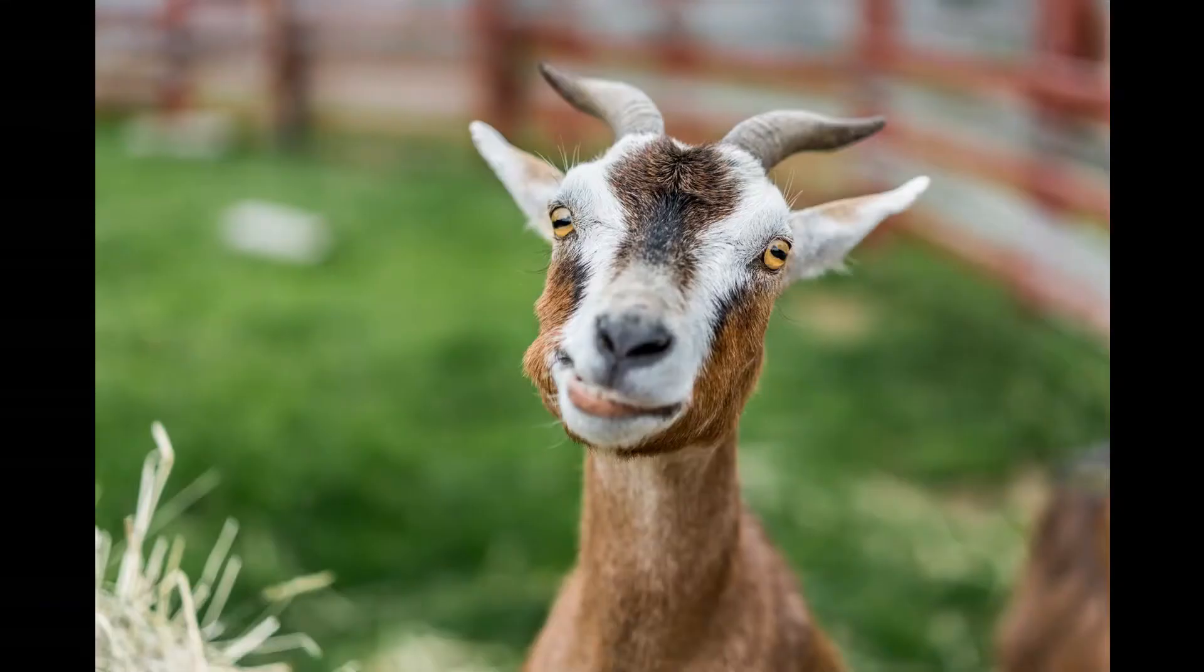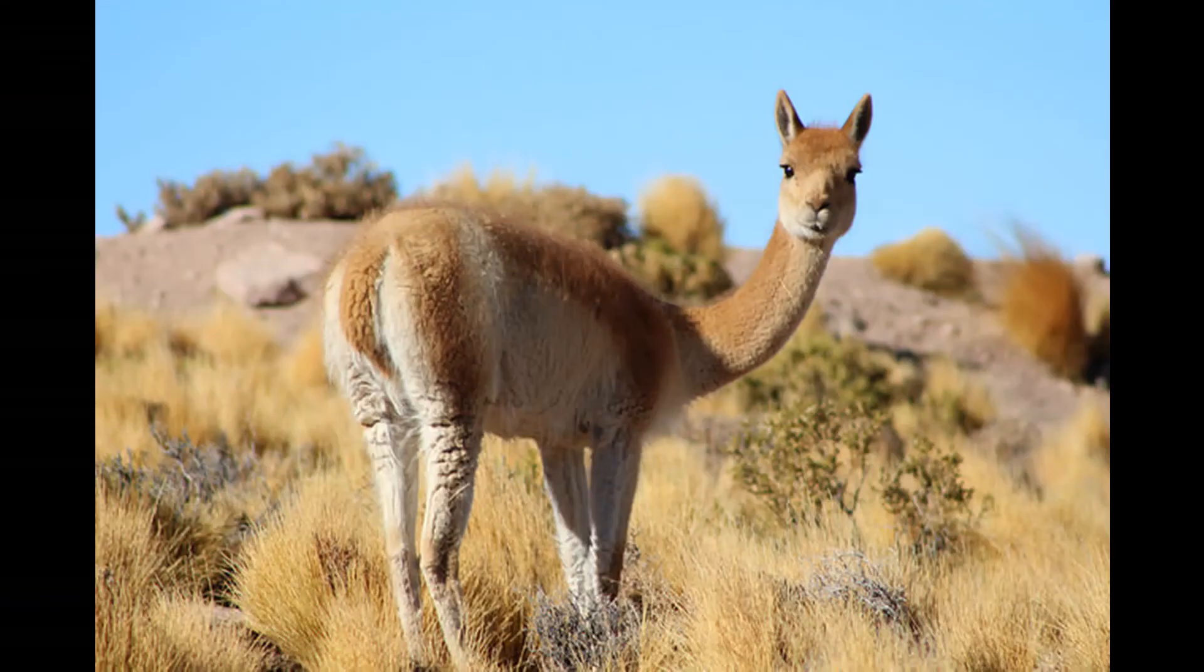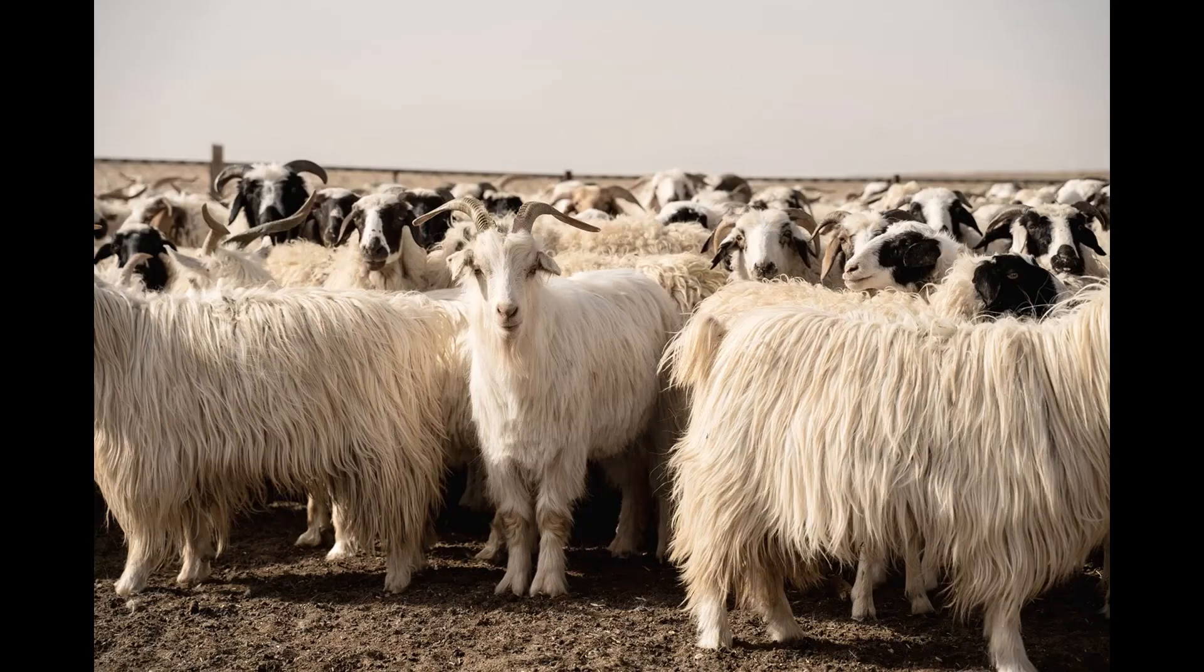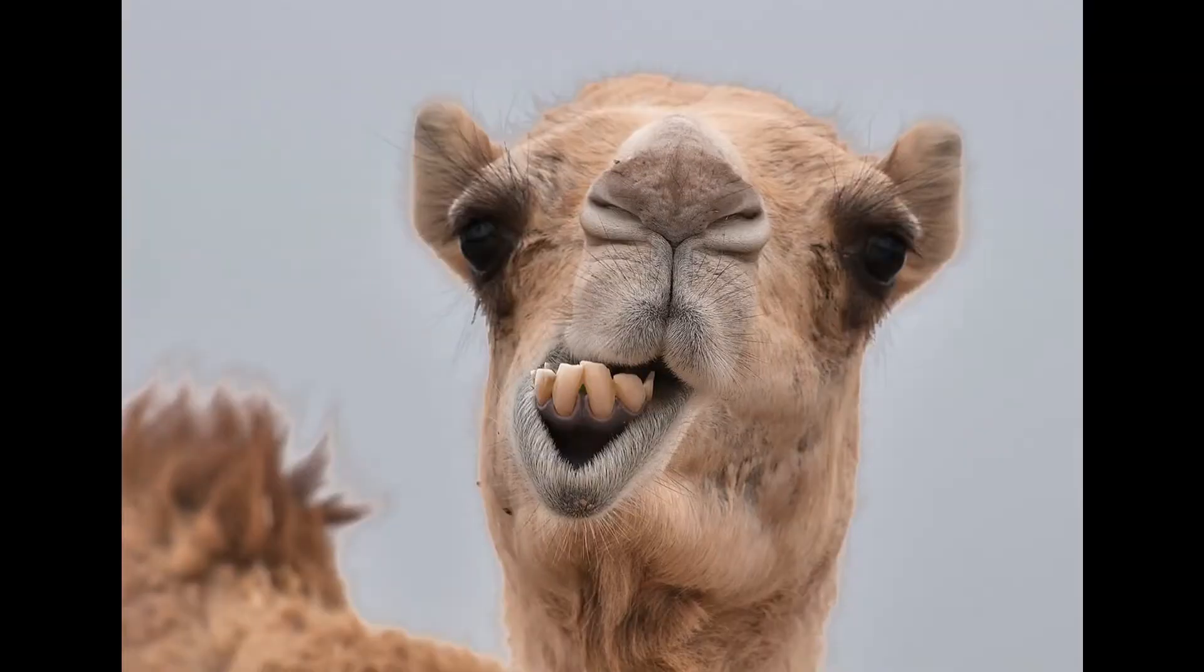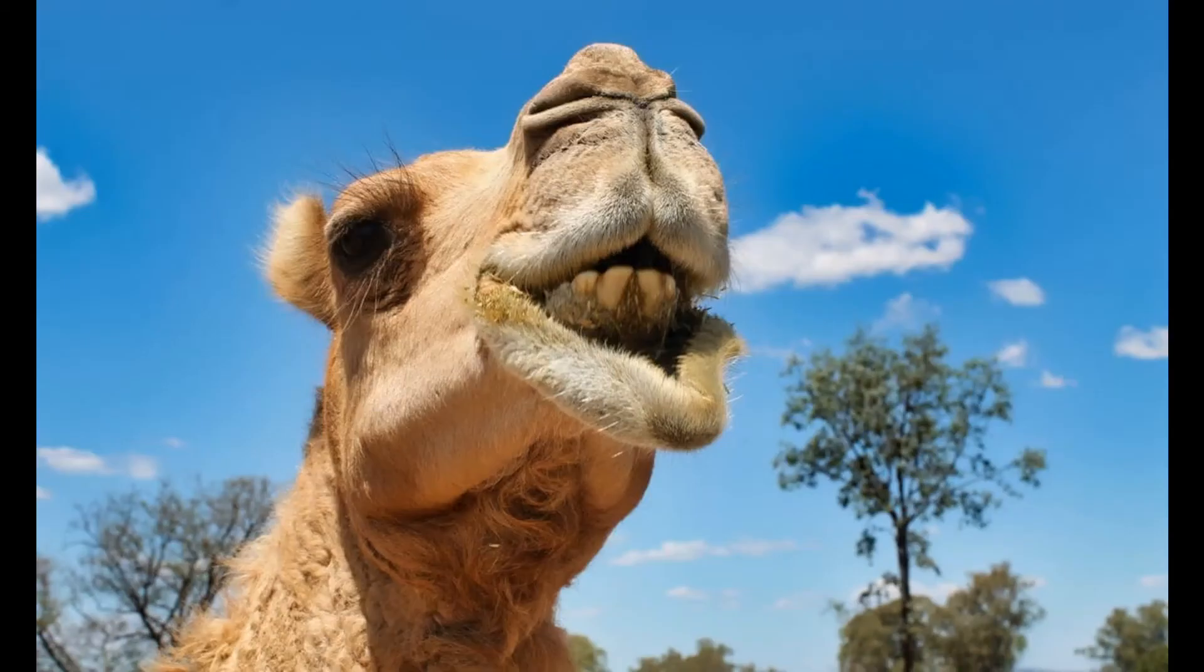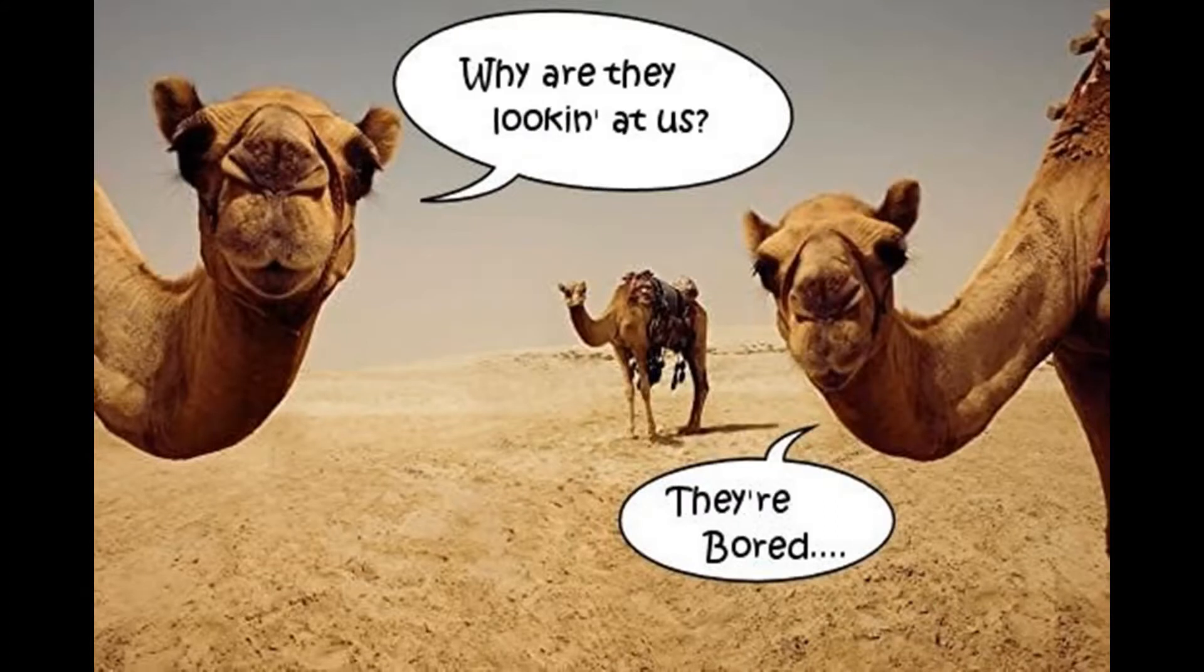Mohair is from North African goats. Then you have alpaca, which is not a goat. It's some kind of cameloid from Peru, which makes it the most expensive stuff in the world. Then you have cashmere, which is from India. And camel hair, that's from several species of camel, but that's usually blended together with other lesser wools to keep the price down.